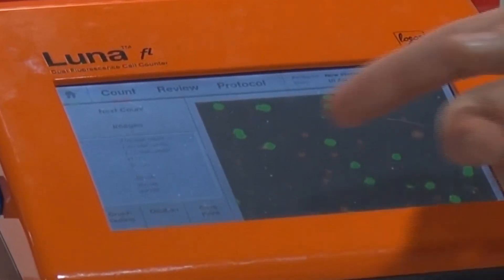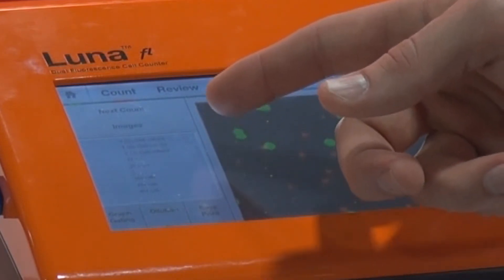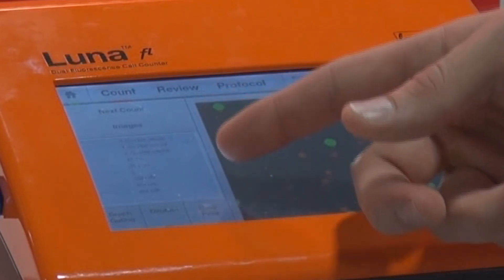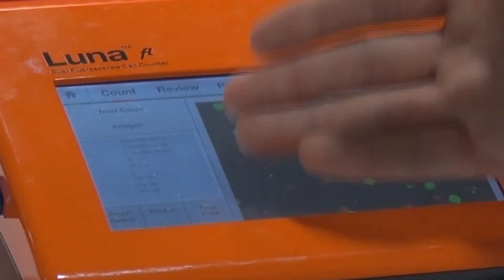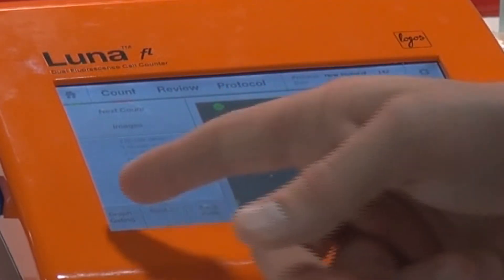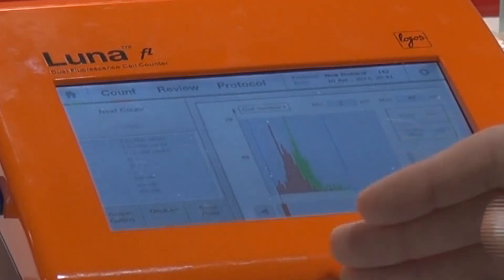After performing the count, the Luna displays all of the information on the left side of the screen, including the total concentration, the concentration of living and dead cells, the viability, the average cell size, as well as the total number of cells counted in the sample. For further analysis, you simply hit the graph and it will display your data in a convenient histogram.